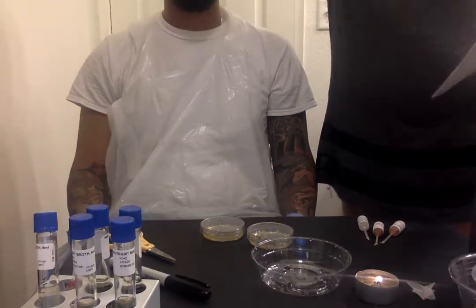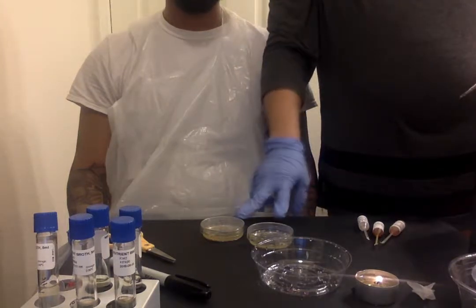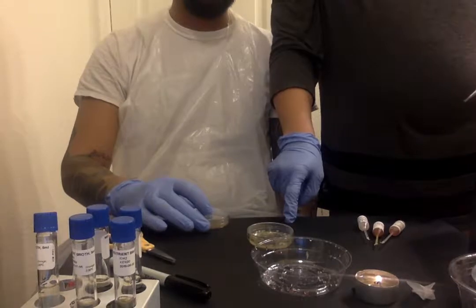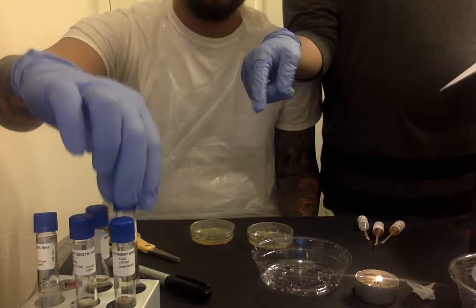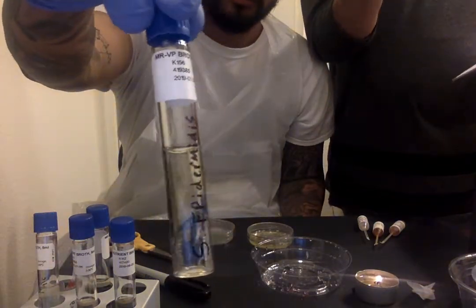Today, September 26th. First, we have our two active plates of E. coli and epidermitis, and then we have the two vials here. We already labeled the broths with E. coli and epidermitis.